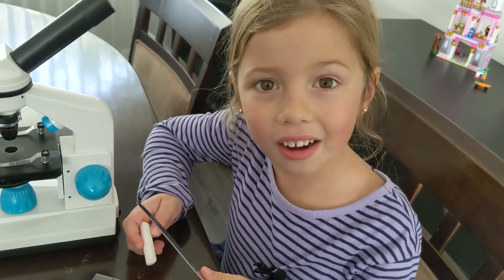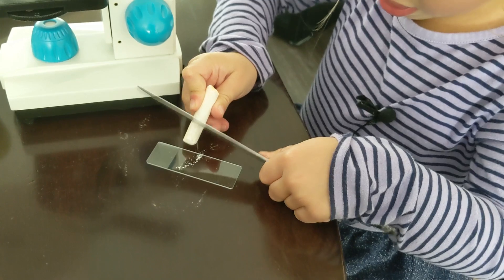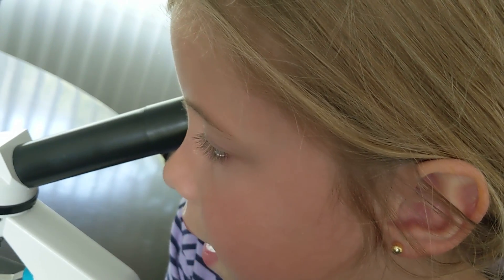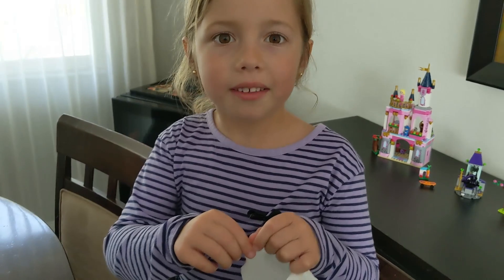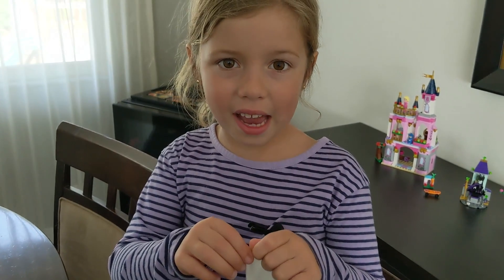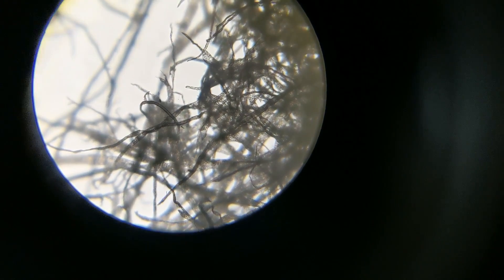We'll start with chalk. It looks like if you could see clouds at night. I'm going to tear the paper towel and look at the edge. I would say it looks like white veins. Now it looks more like tree branches.